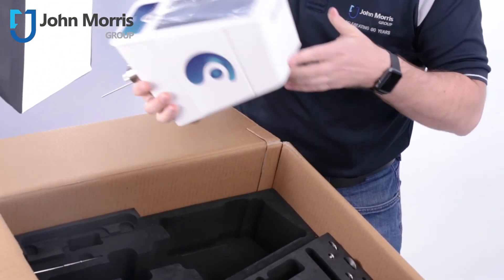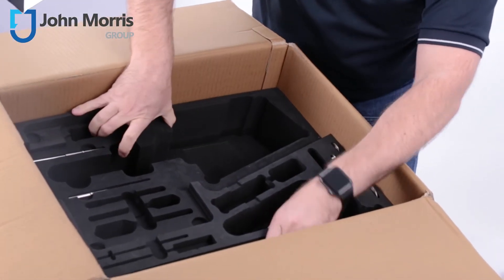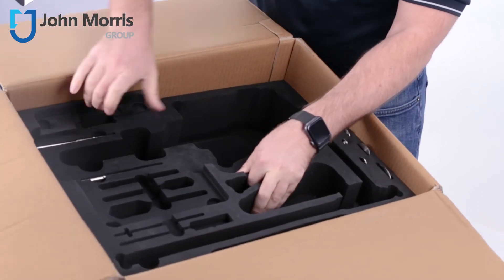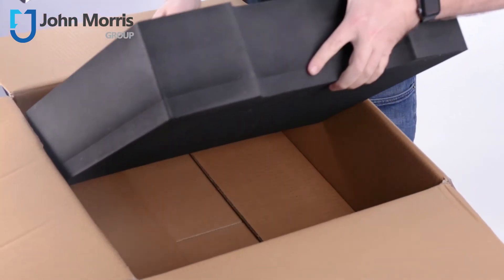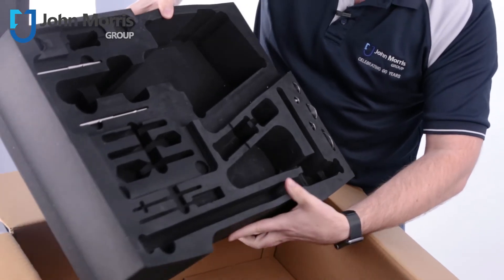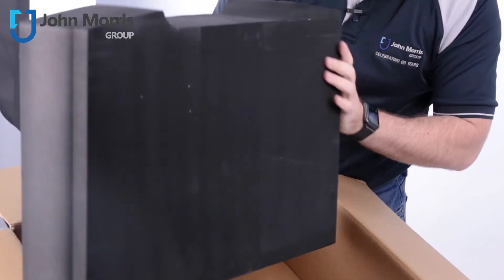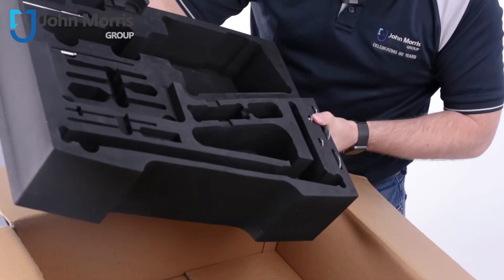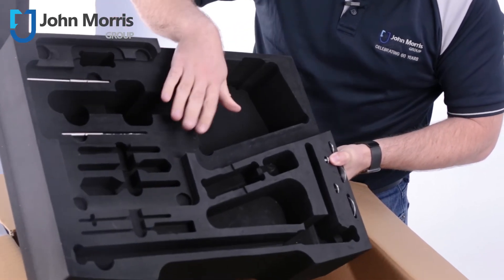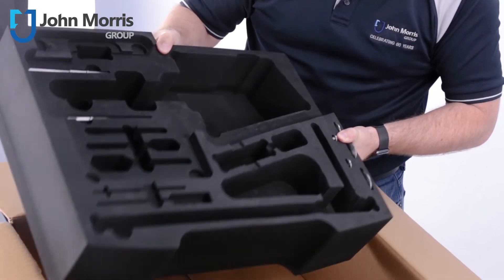Beautifully done, Lamy. I just wanted to pull this one out and show you exactly what it looks like — this moulded piece of foam — because it's quite special. Check this out. All of these beautiful pieces of moulding. Usually, when we have cases and people are doing laser moulded foam, they charge hundreds and hundreds of dollars for a piece like this. And this comes with every single Lamy unit.